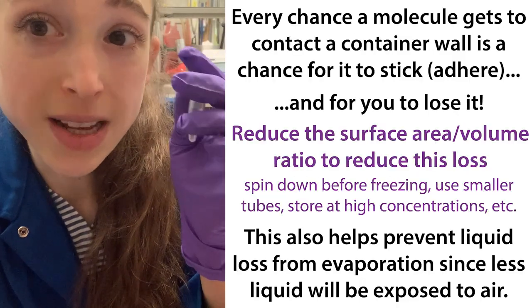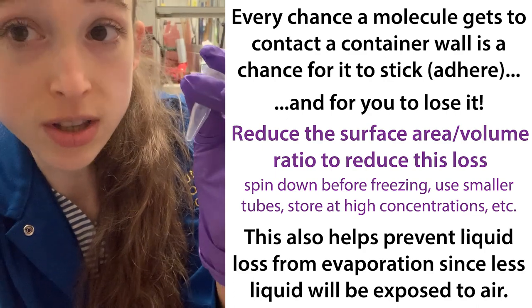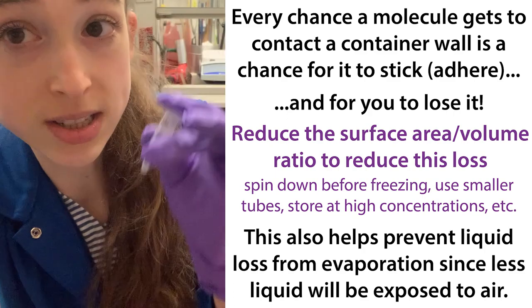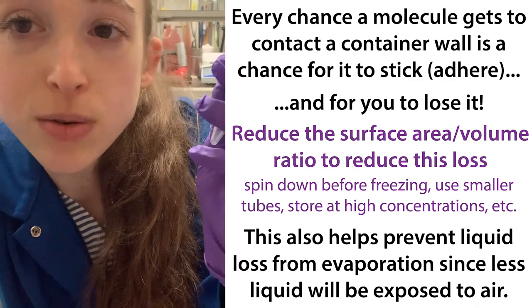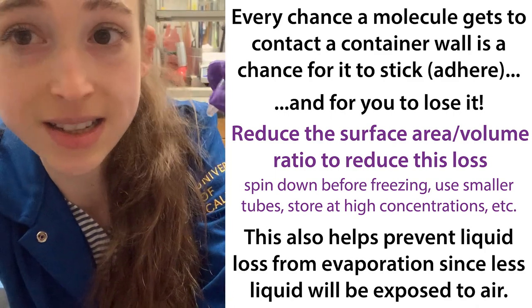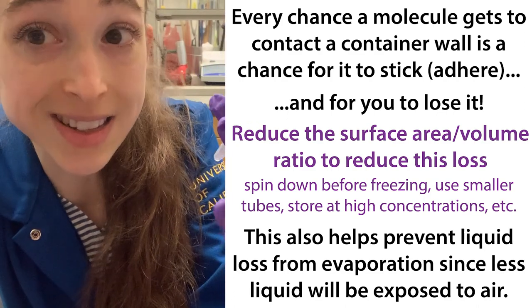Basically, it's all about minimizing the surface area to volume ratio. Even if you use low bind tubes, you're still going to have some molecules sticking to the sides of the tube, and this is going to cause you to lose some of those molecules you care about. It's going to mess up the concentration — it's going to be less because some of it's stuck to the side of the tube.